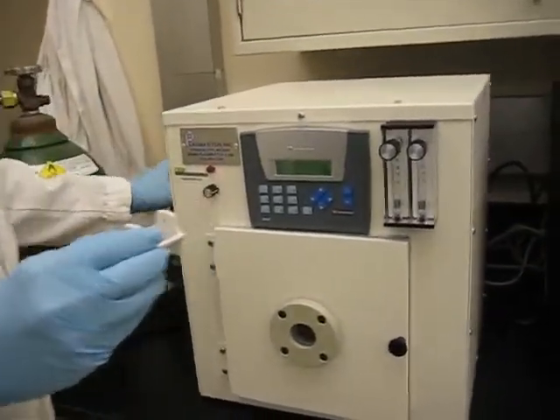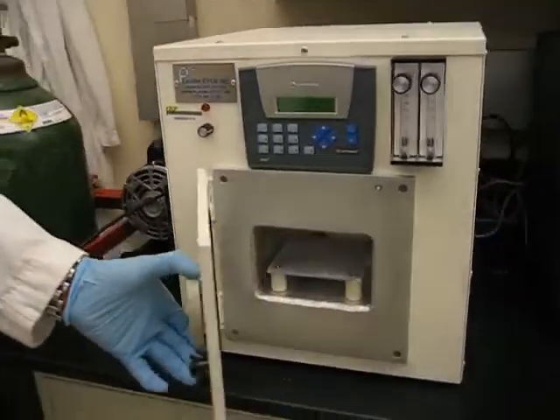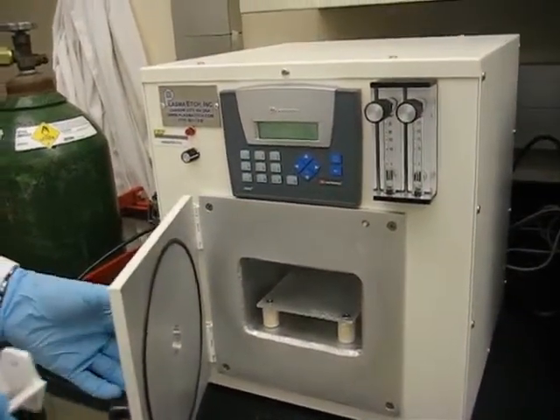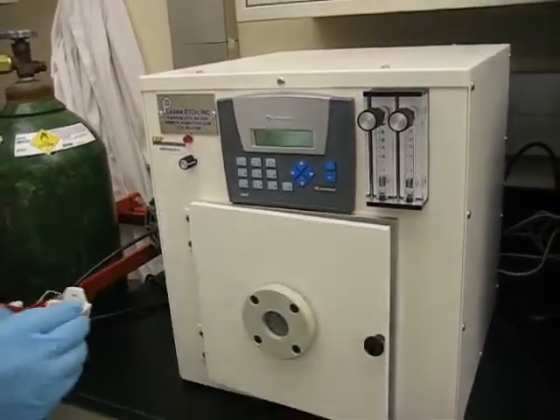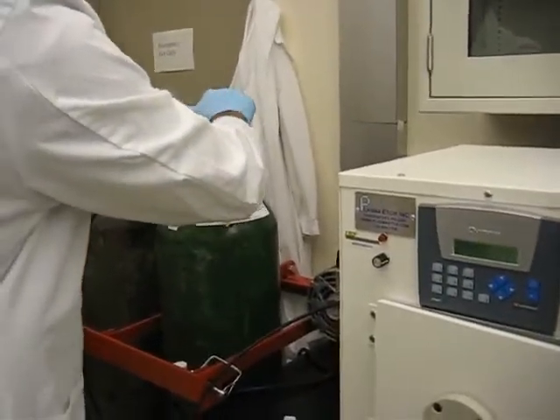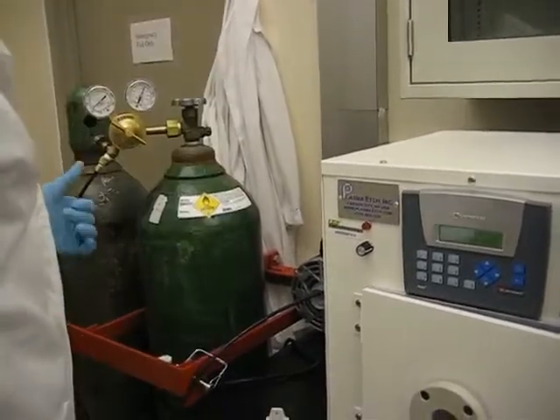We have this oil pump which creates vacuum in this chamber, and we try to keep this chamber really clean of any organic material. Right now I'm switching on this machine. First, we turn this oxygen cylinder — it uses oxygen plasma. The pressure is at 15 psi.